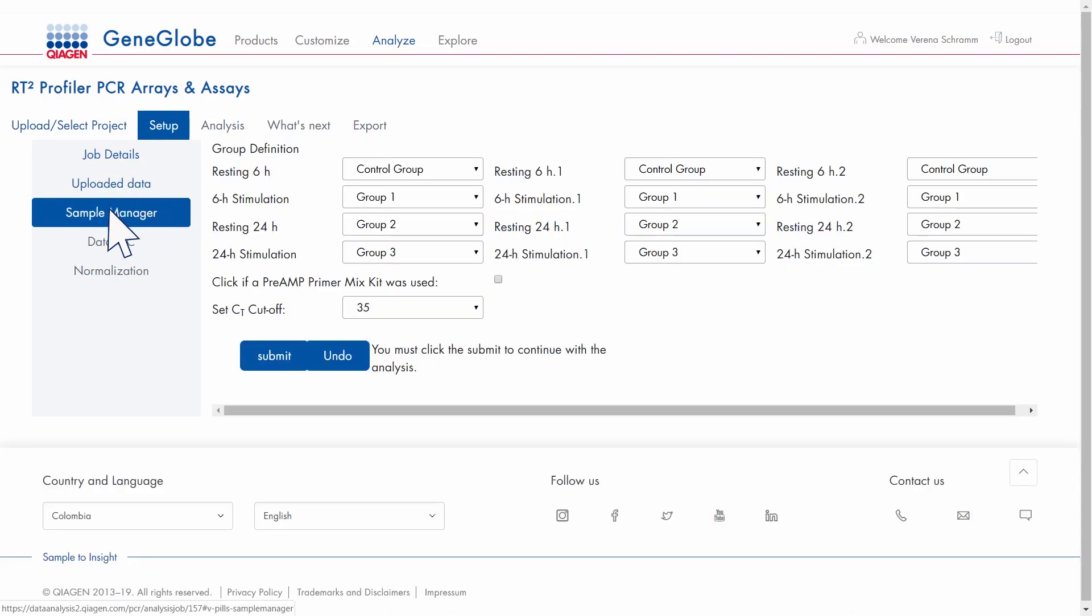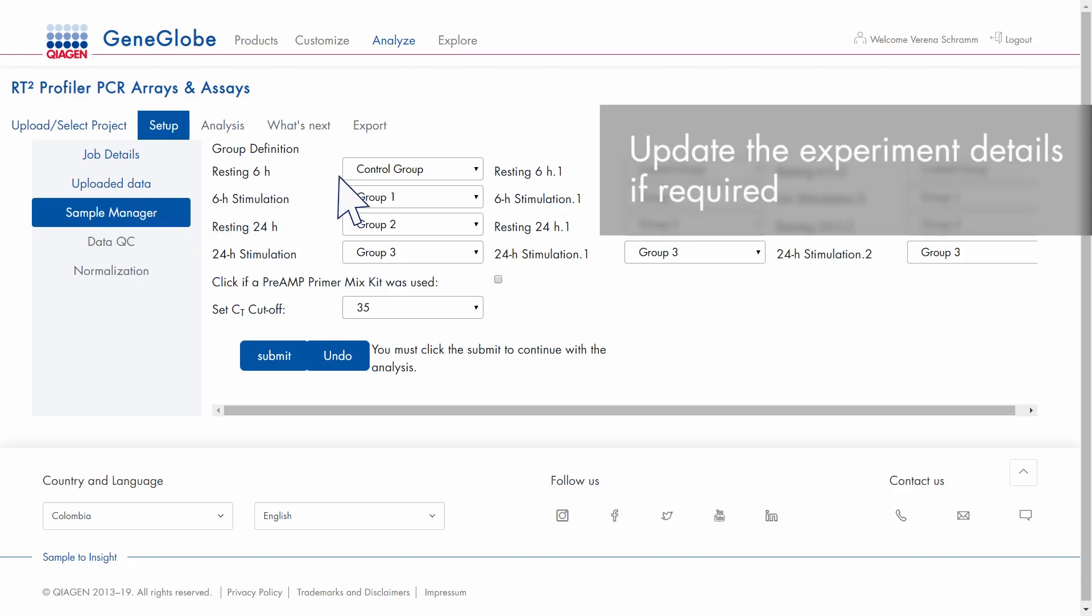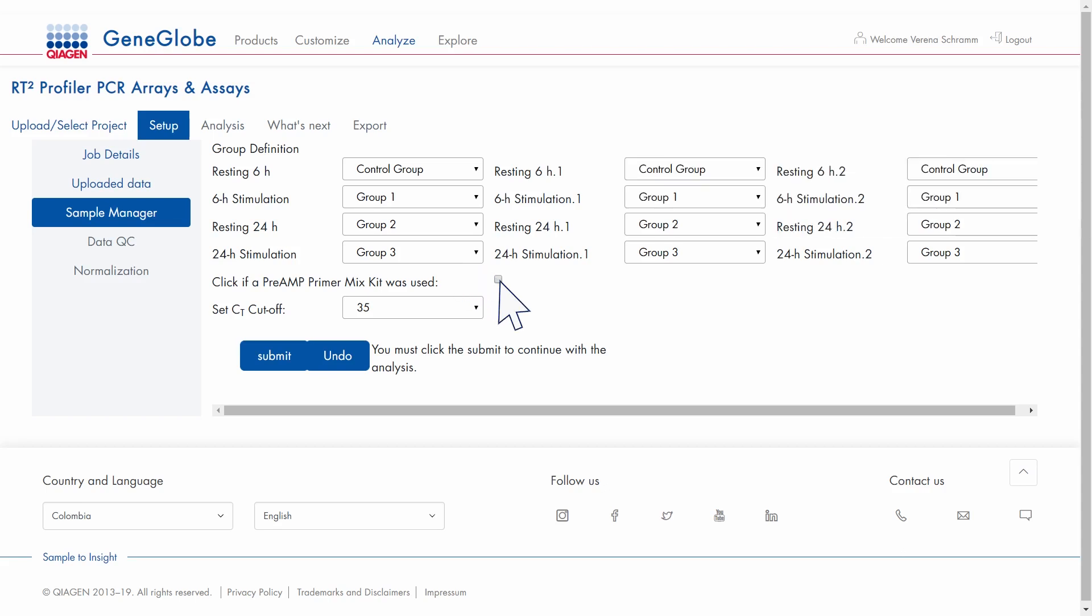Click Sample Manager and enter or update the group definitions. Indicate whether you used a preamp primer mix. Adjust the CT cutoff if necessary and submit.